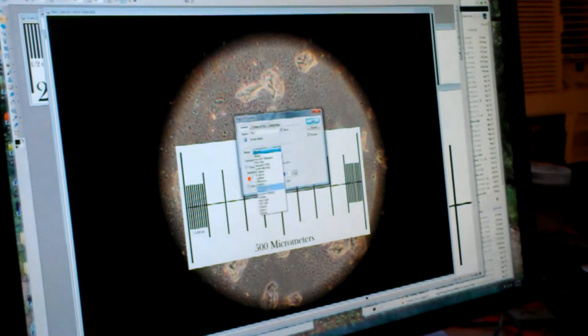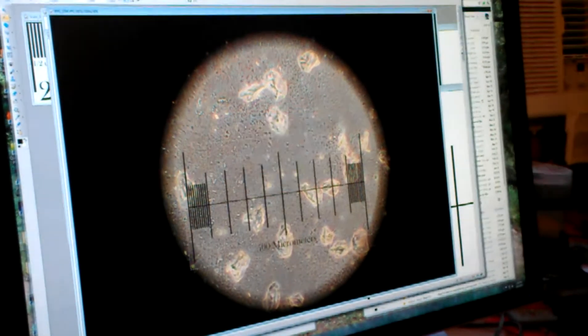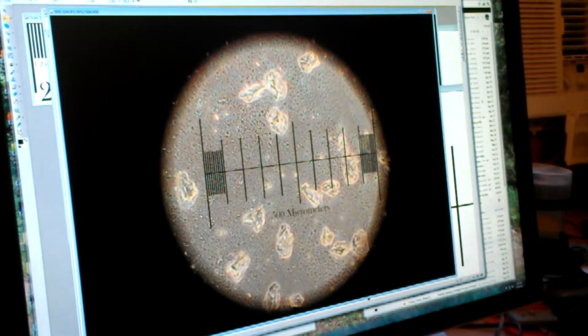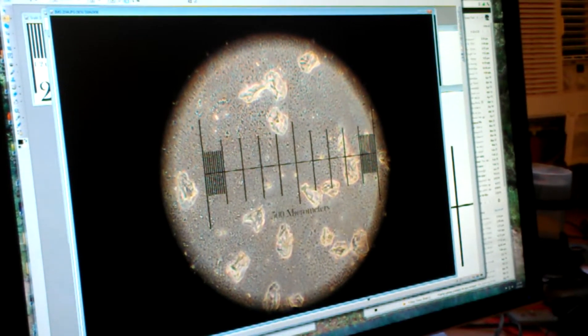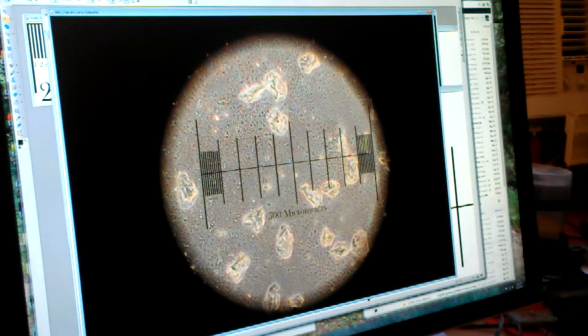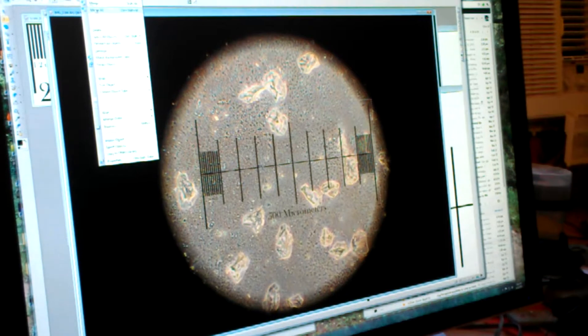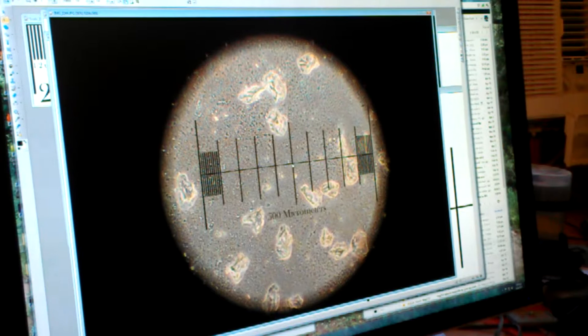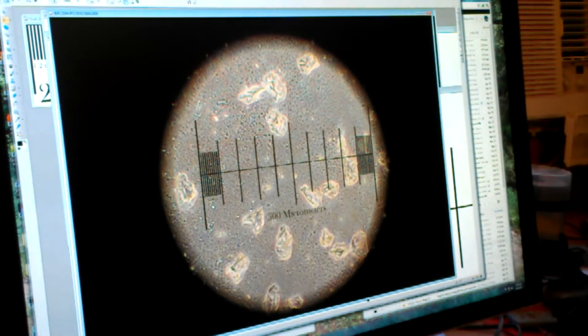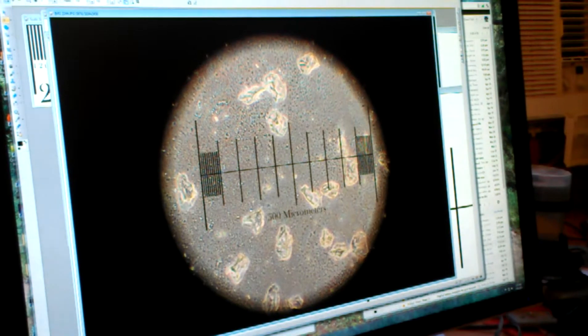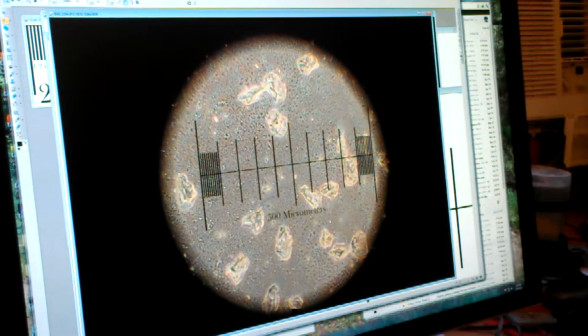So let's set it for darker and then there we go. Okay, so these are cells from the inside of my cheek. They're about 50 microns across, so about half the width of the paramecium that we took photos of with the cell phone.